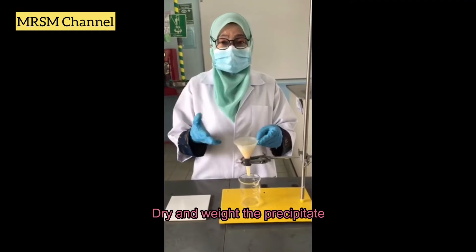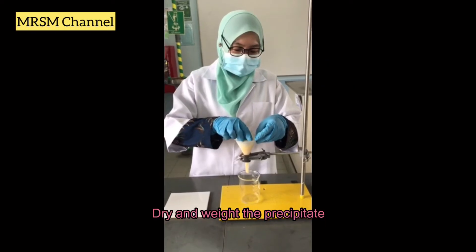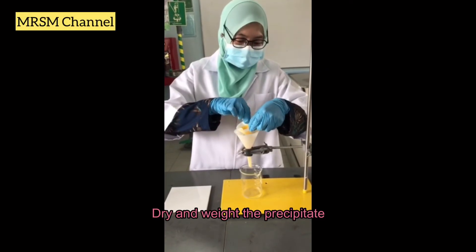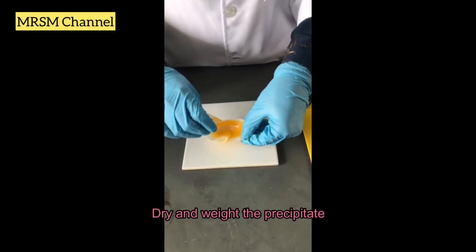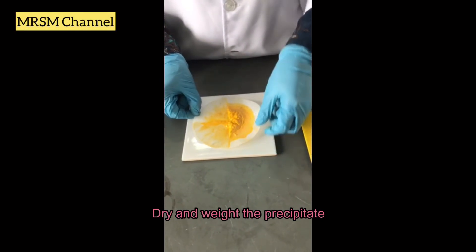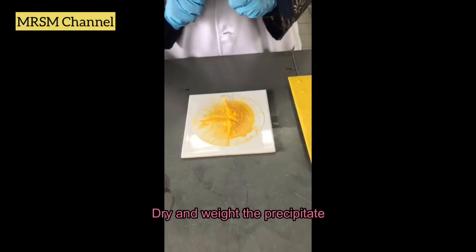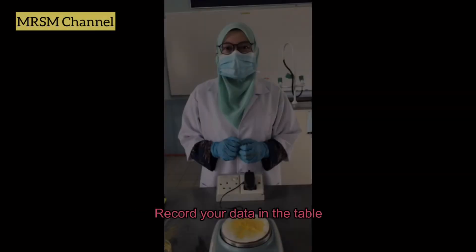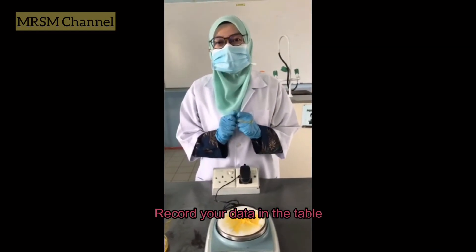Once filtration is done, carefully take out the filter paper from the filter funnel and put it on the marble tile. Leave it to dry, and after it is dry, weigh the precipitate and record your data in the table.